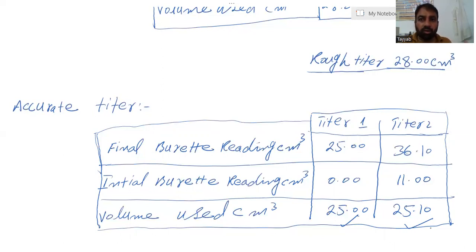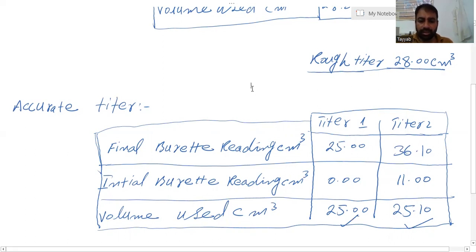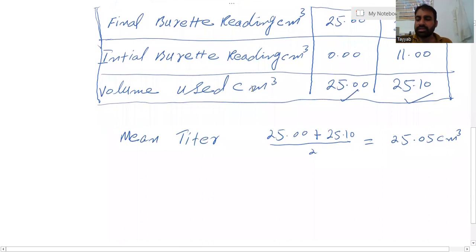But what normally students do to gain these 3 marks, they may lose all their marks by doing it fast and falsely, taking more than 2 titrations. I do not advise my students to take more than 2 titrations. Okay, after taking titration, what is next? The next is to take the mean titer. After taking the mean titer, now is the time to do the calculation, and all this calculation depends upon your earlier knowledge. Hope you understand all this.